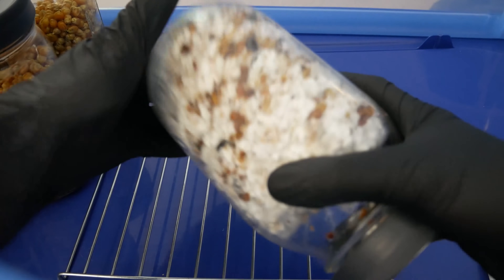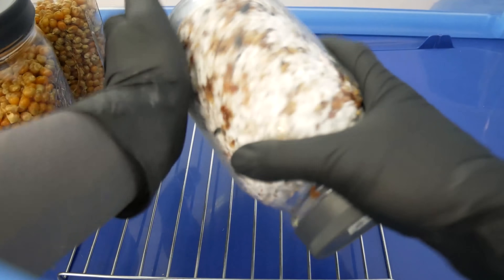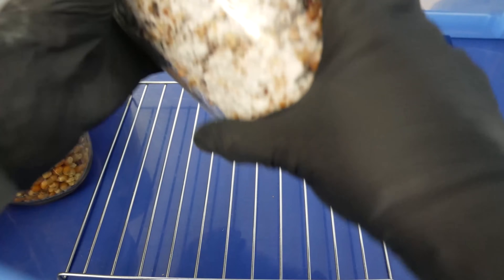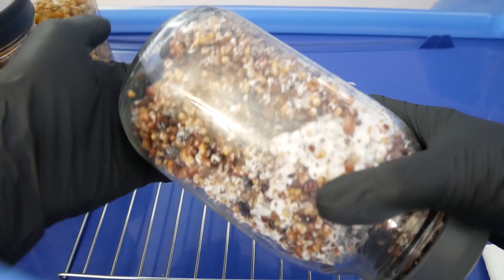The very first thing you want to do is break apart the colonized grain jar so it's much easier to transfer. This part is going to take a little effort and some time, so have patience and keep at it. You can use a tennis ball, a roll of duct tape, or a rubber tire to smack your jars against in order to help break it apart.